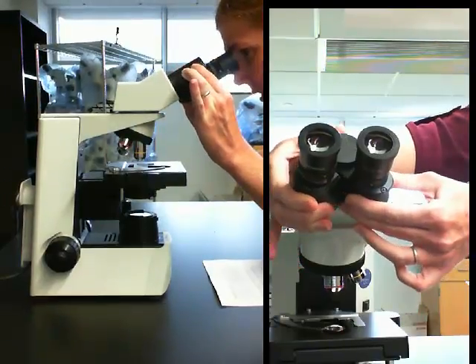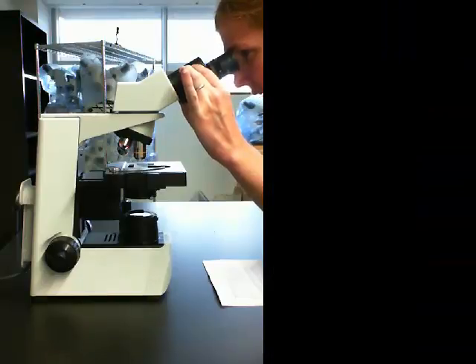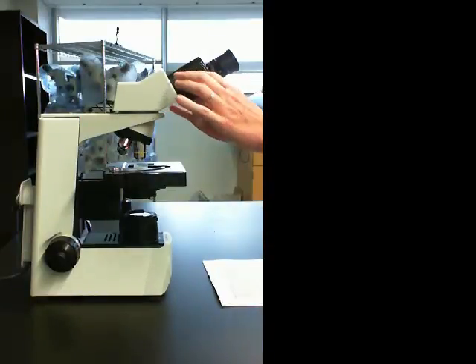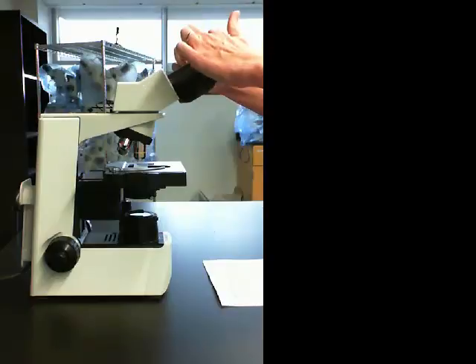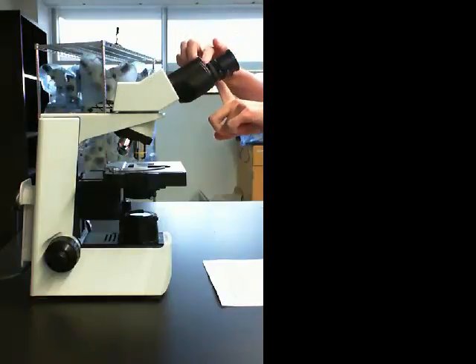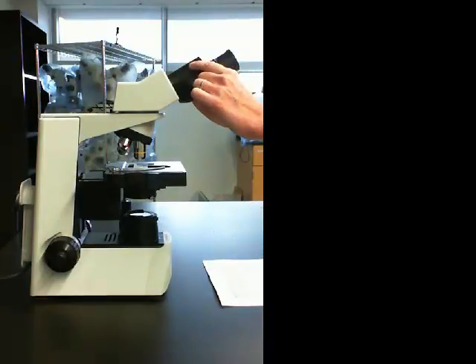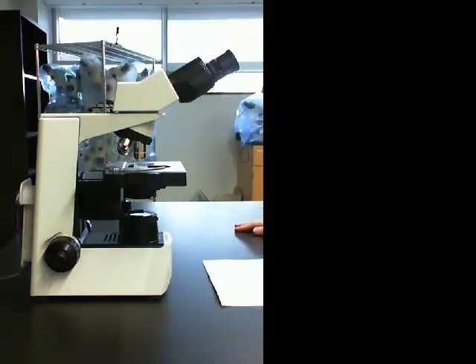You'll look through it and you'll adjust them until you have a single circular field of view. If you have two distinct circles or even two overlapping circles, this is not set correctly. Again, you should see a single circular field with both eyes open. We recommend that you write down this distance, as there's a measurement here on your scope. Write that down so that when you use a different scope or even the same scope in the future, you know where to start, at least, to have the best chance of having the correct interpupillary distance.